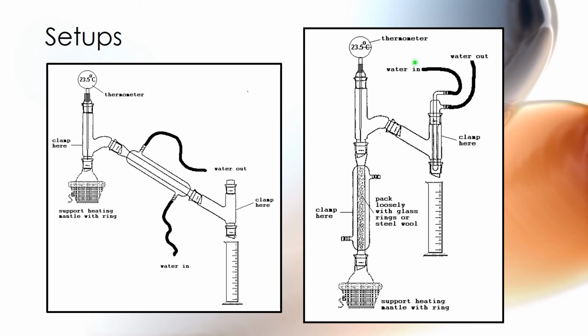And so your water in will go here on the top where it goes, which fills into the cavity. The cavity fills up and it drains out of the top into the drain, and that will condense the liquids on this cold finger right here. And again, we're not heating a closed system because this is open, so make sure that you do that correctly.